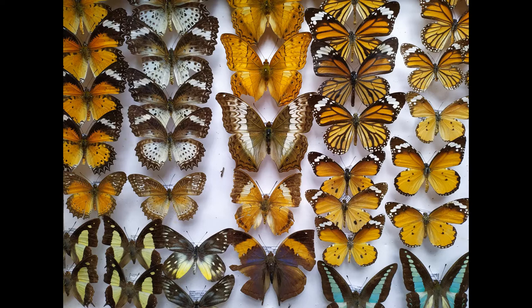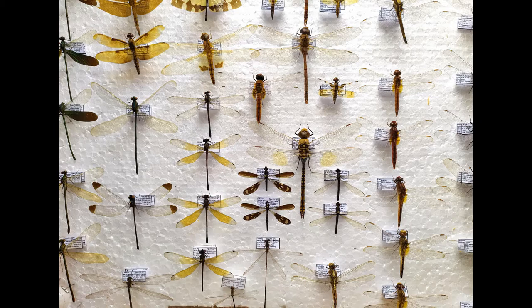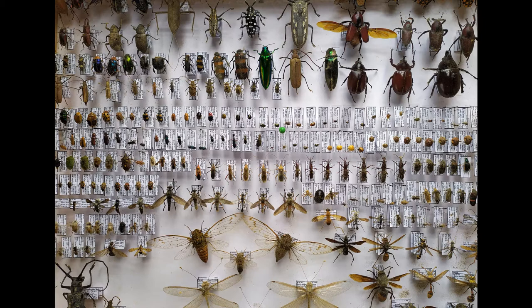Pinning and spreading insects is a routine activity in any natural history museum and by insect hobbyists. The ability to pin and mount insects in a proper way is an art in itself and requires a great deal of patience and practice. Insects are collected and preserved for both education and art by scientists, amateur entomologists, teachers, students, and hobbyists.